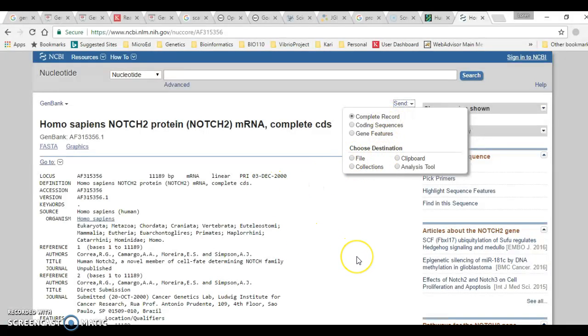So that's all I'm going to show you. I just want you to be aware that this is just a snippet of the information that you can get from an annotated genome. It allows you to really thoroughly study and investigate a sequence once it's been identified on a genome. You can identify the neighbors and so forth. And for the human genome, that's been really well established.